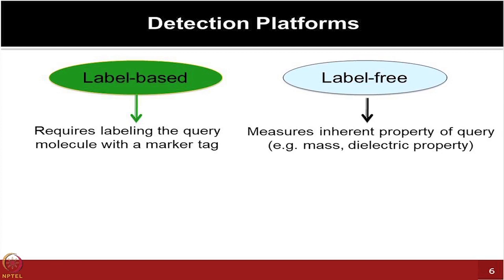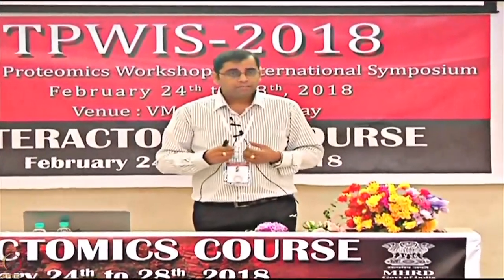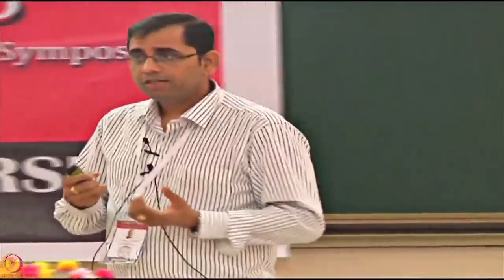As a result, many types of label-free platforms have emerged, which essentially aim to look for the properties of the molecule itself. If two molecules are binding, what kind of mass is getting changed? What kind of dielectric properties are getting changed? Do we see some sort of percentage reflectivity change because of the binding intensity? Can we see some sort of interference change? Many of the physical principles are being used to look at the molecules and molecular interactions, and can we measure those properties?